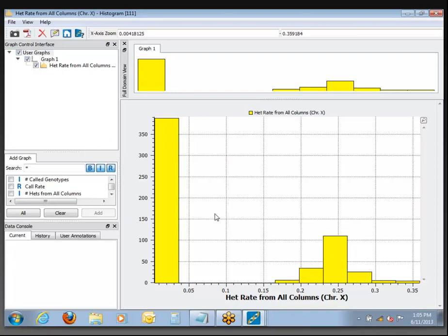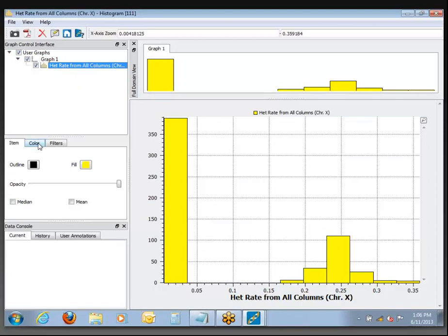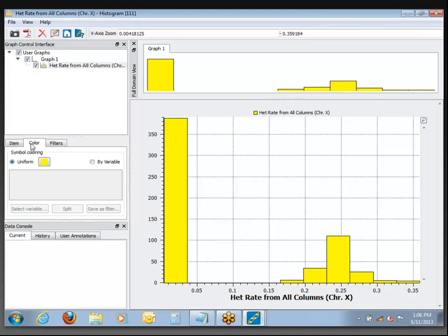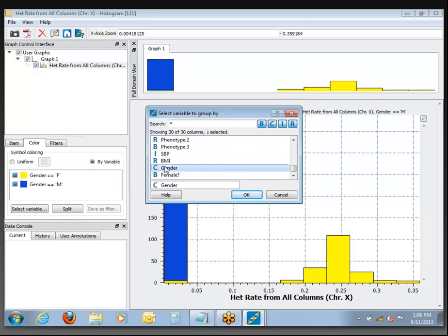This time I'm going to make the coloring work correctly. We're going to recolor these according to the originally stated gender from the phenotype spreadsheet. To do that, click directly on the variable name — 'het rate from all columns' — when you click right on the variable name, that's where you get the options that control how that variable is displayed. Come into the Color tab, where you can change how it's colored and color it according to a second variable. Click 'By Variable' and select the gender variable from the list.